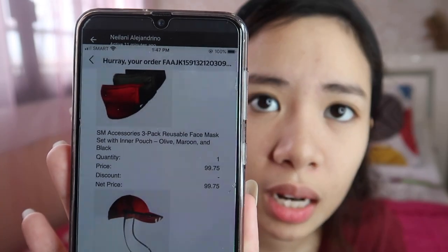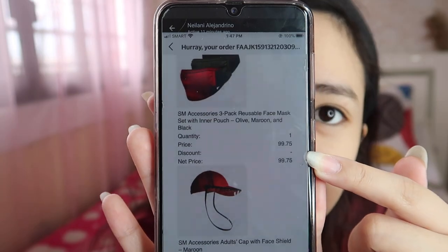It's very fashionable, I must say. I really recommend it, guys — pero medyo mamahali lang, 250 pesos is my comment on that. The last product we bought from SM is the 3-pack reusable face mask set with inner pouch — in colors olive, maroon, and black — priced at 99.75 pesos. So that's three masks for basically 100 pesos — about 33 pesos each.